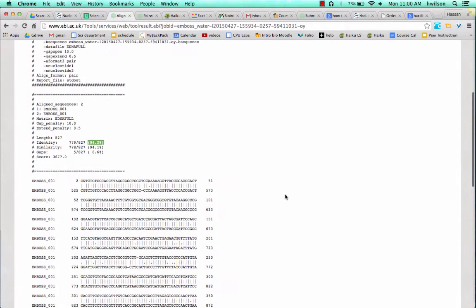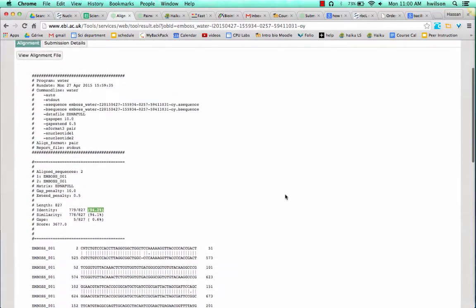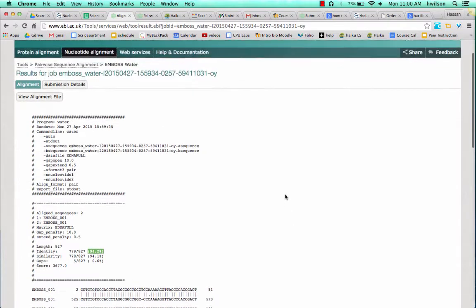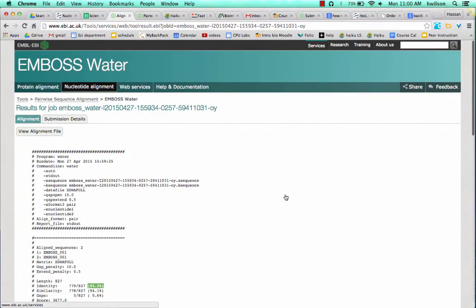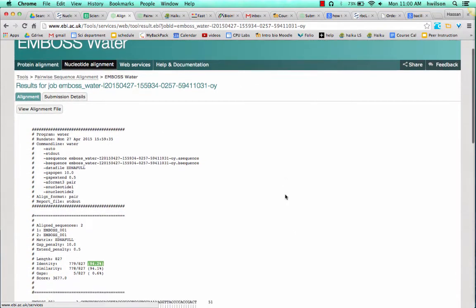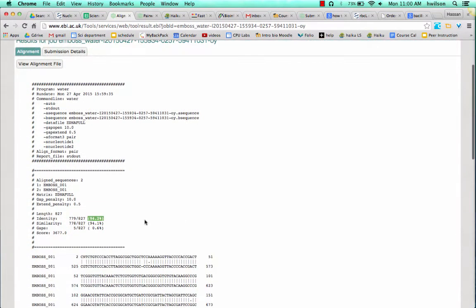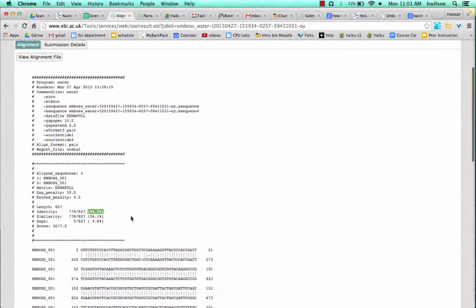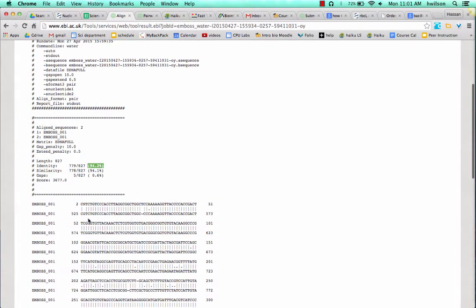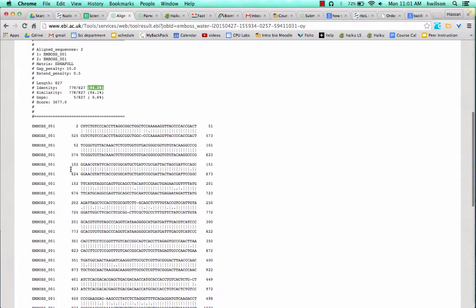One final thing I would add for this method is if you use Emboss Water, your percent identities may be higher than normal. That's because this method is only comparing the parts of the sequences that align. So if one sequence was much longer and had a hundred bases in front of it, that's being ignored by this method.